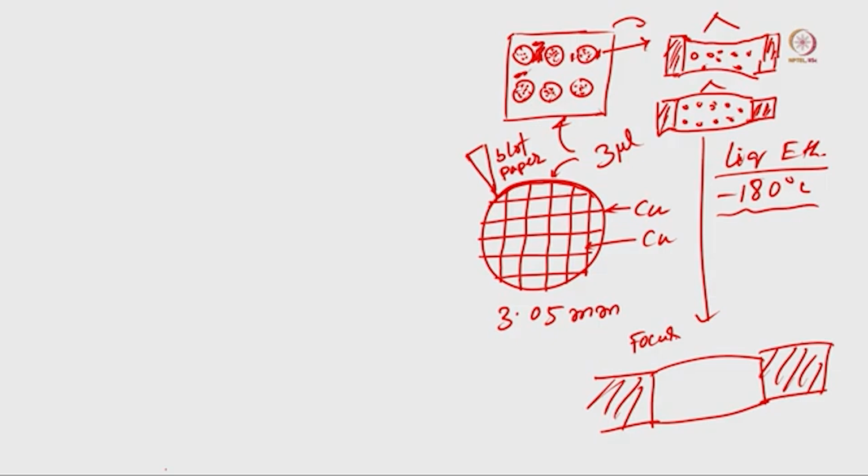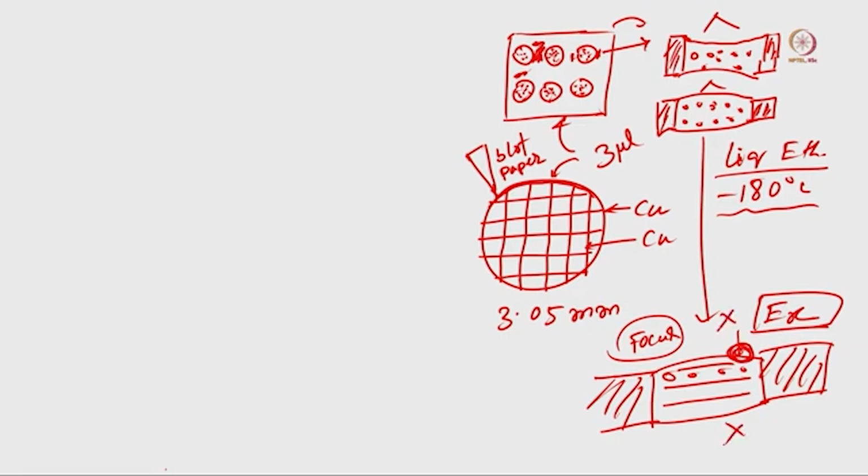for any imaging, there will be two things. One is exposure, which means when we give a certain dose and collect the data, and the other is that you have to do the focus. Now, if this area is amorphous ice with protein embedded in it, and I want to focus in this particular area, what is going to happen? Your electron dose has high energy, so it will start melting this entire ice and give a thermal drift also, and your sample will be exposed before you collect the data, during your focus. So that is a problem. That is the reason we cannot focus within this ice.